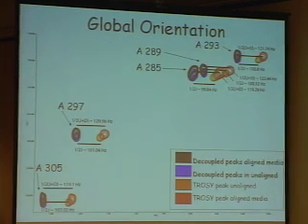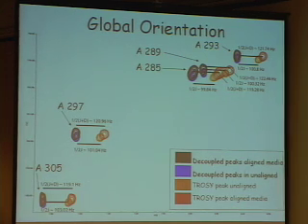This differs from our NOESY spectrum in that instead of relating proton to proton, now we're relating proton to C13. So using our two-dimensional NOESY spectrum previously, we're able to assign these peaks specific C13 proton interactions.